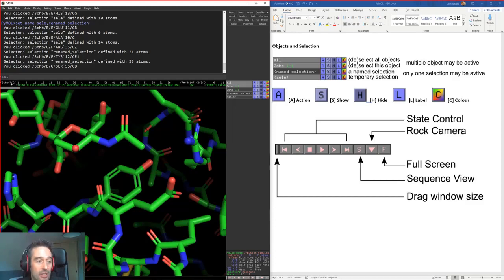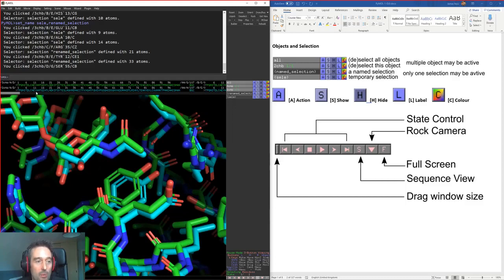Well, actually, the first one here, the A, is the segment. Then you've got D, which is the chain, and then you've got the residue numbers, and of course the amino acid sequence down below. And if we add another object on, we add another line onto our sequence. Now, with all of the left clicking, middle clicking, etc., that we talked about earlier for picking the different atoms and selecting atoms, you can do the exact same thing on the sequence view.